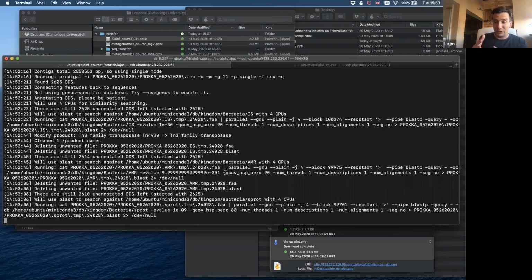If you are doing a core genome alignment, which means that you have 100 isolates, you have 100 assemblies at the end, and you are only comparing those gene sequences that you can find in all of them, or at least 98% of them, this is what we call a core genome. It is core genome because all of your isolates have those genes.